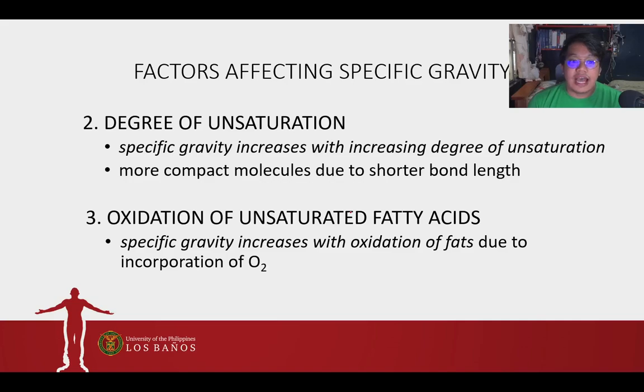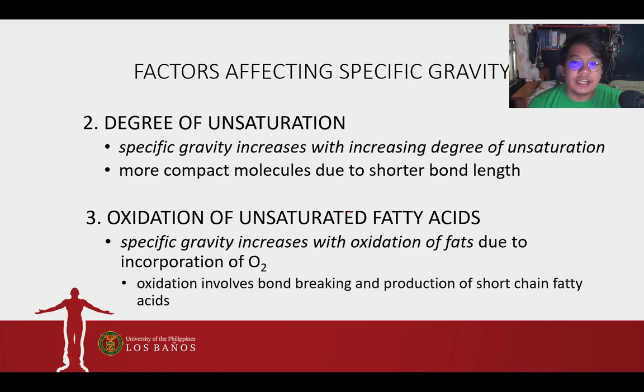As we get the specific gravity, ang specific gravity ay ratio ng density of oil to the density of water. So, tumataas yung value ng numerator natin, kaya tumataas yung value of specific gravity natin. The oxidation involves bond breaking and production of short-chain fatty acids.